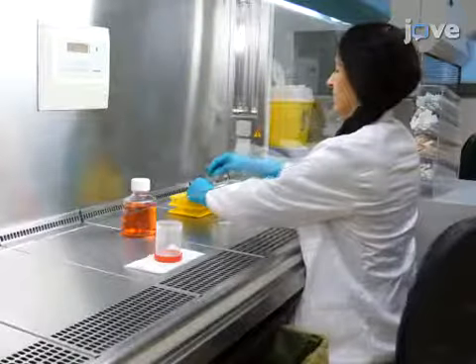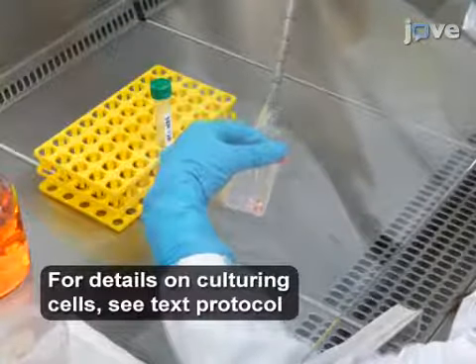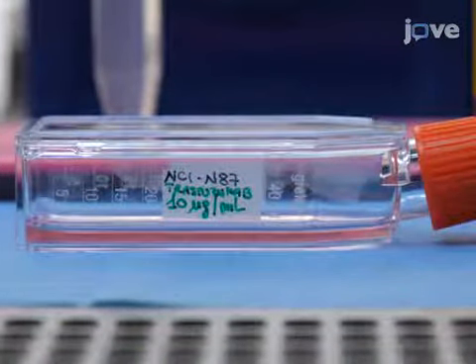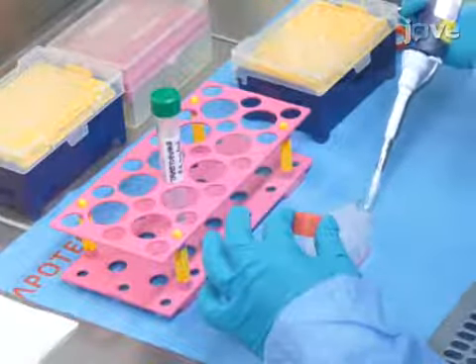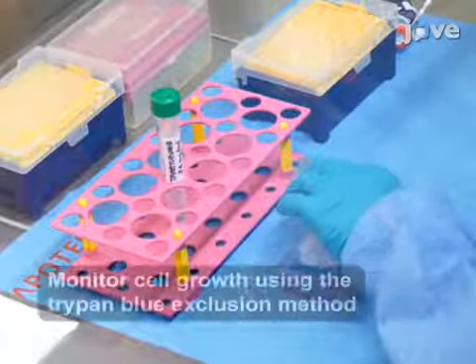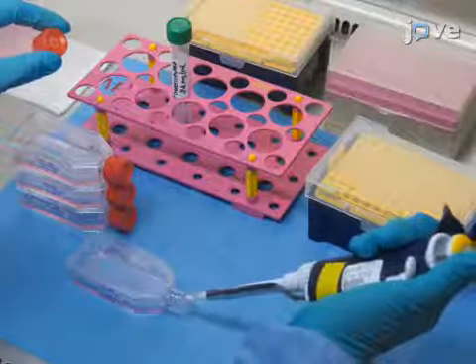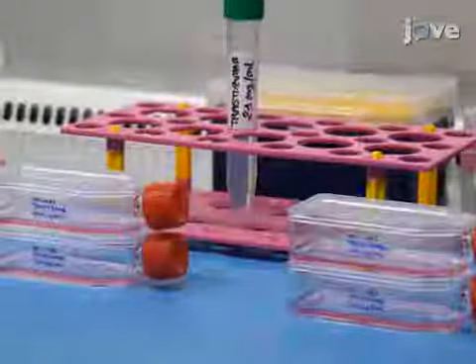To begin this procedure, seed NCI-N87 cells into 25 square centimeter culture flasks. Add 10 micrograms per milliliter of trastuzumab to the culture medium in each flask. Expose the cells to this starting dose until they resume growing. After cell growth has resumed in approximately 2 weeks, expose cells to a 100 microgram per milliliter concentration dose of trastuzumab. Continue gradually increasing the trastuzumab concentration, waiting until the cells resume growth before each exposure, until a concentration of 400 micrograms per milliliter is reached.